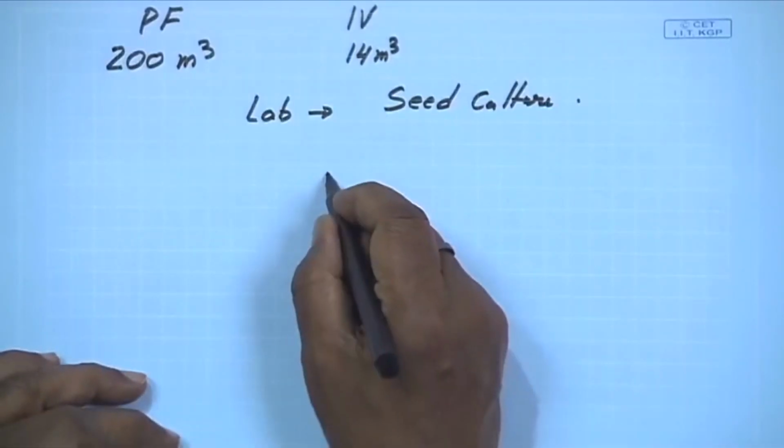In the case of unicellular cells or yeast cells, we don't have any problem. We can use them directly. We can count the number, and we can find out exactly what number of cells is required for the preparation of the inoculum. So that number you have to maintain. Then we put it in the seed can, like this.